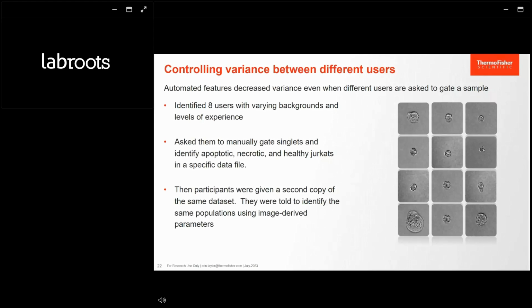While there is a lot of anecdotal discussion and a lot of strong belief that using these image parameters would reduce variance and would enable more consistency and meaningful comparisons between users, one thing we absolutely learned using this, as you saw earlier in the process, is that we should not rely on our judgment to see cause and effect.